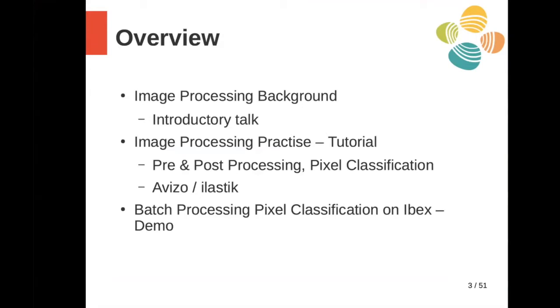So what we're going to talk about today is a little background on image processing, which is what I'm going to provide next. That basically will be providing the conceptual framework to help understand the rest of the tutorial and the walkthroughs of the tools. Dina will then provide a tutorial walkthrough to show pre and post processing with the Avizo and pixel classification with the two main tools that we support. And then at the end, I'll provide a batch processing pixel classification demo on Ibex, which is our HPC cluster, to show you part of a complete workflow that lets you interactively work on a workstation to train the pixel classification, but then run the compute heavy processes on a large computer.